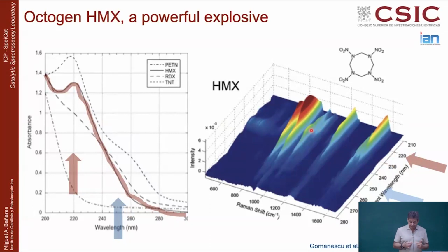But if you know this and you use that information, you can get a lot more of a wealth of information from your spectra. Of course, having a Raman system with a continuous tunable laser is not something that everybody has. There are very few, but this is very good for this kind of result, and visually it's also very attractive.